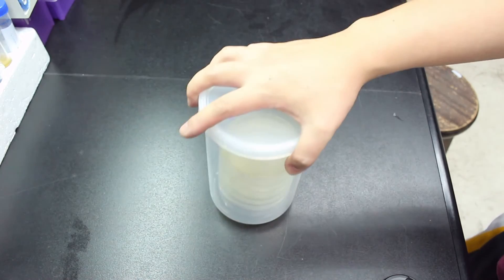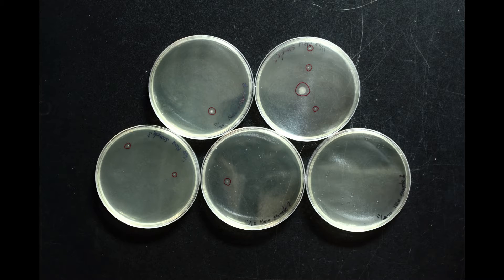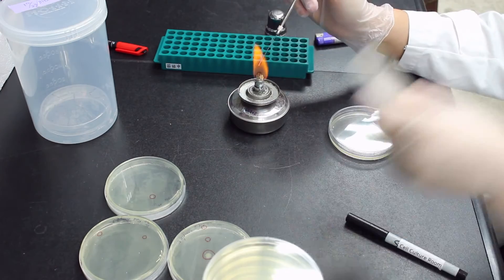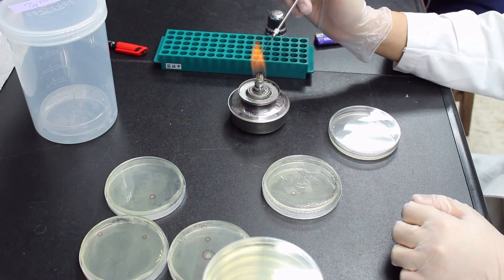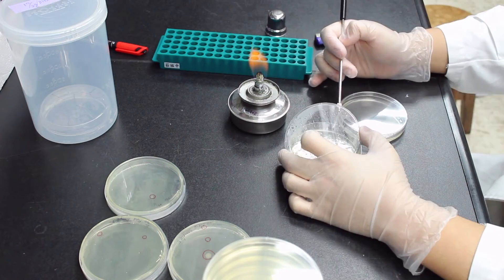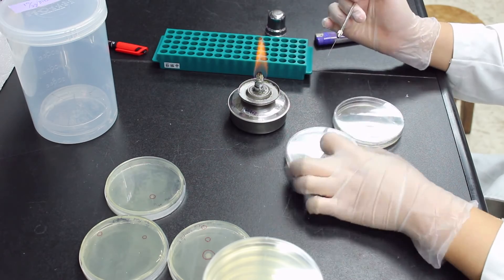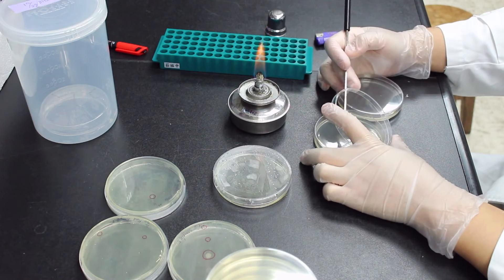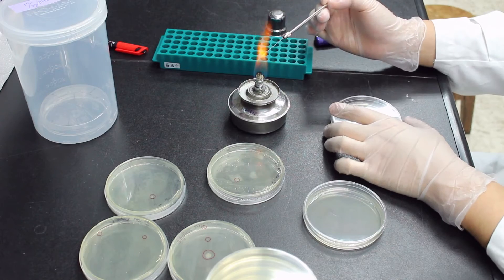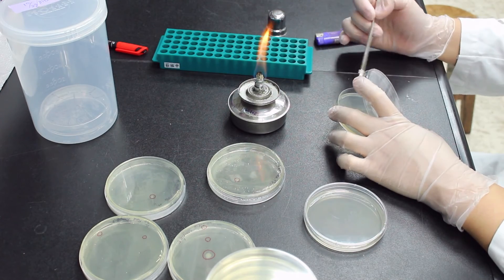Now let's check the result. You can see there are several colonies growing on the plates. I'll pick some of them for further confirmation, which is putting them under 65 and 37 degrees to see if they grow or not. Because bacteria that can grow under 65 and cannot grow under 37 degrees is a legit thermophile.